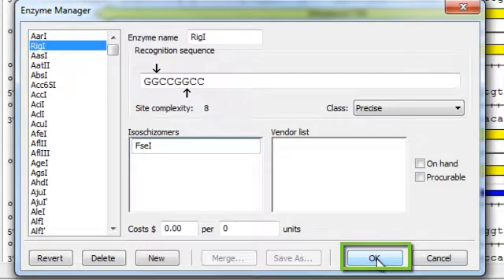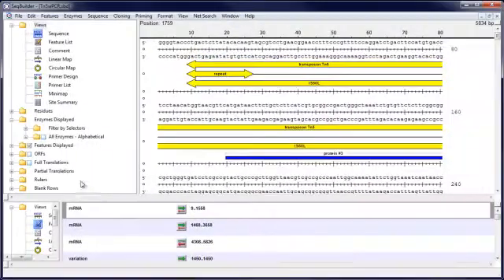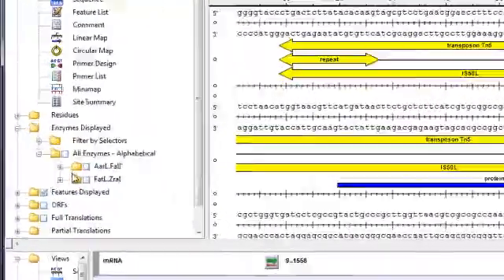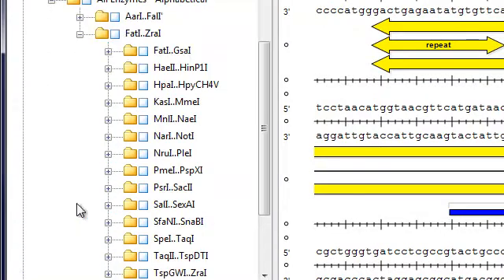Then click OK. And now your enzyme will be added to the list of enzymes in the SeqBuilder curtain.